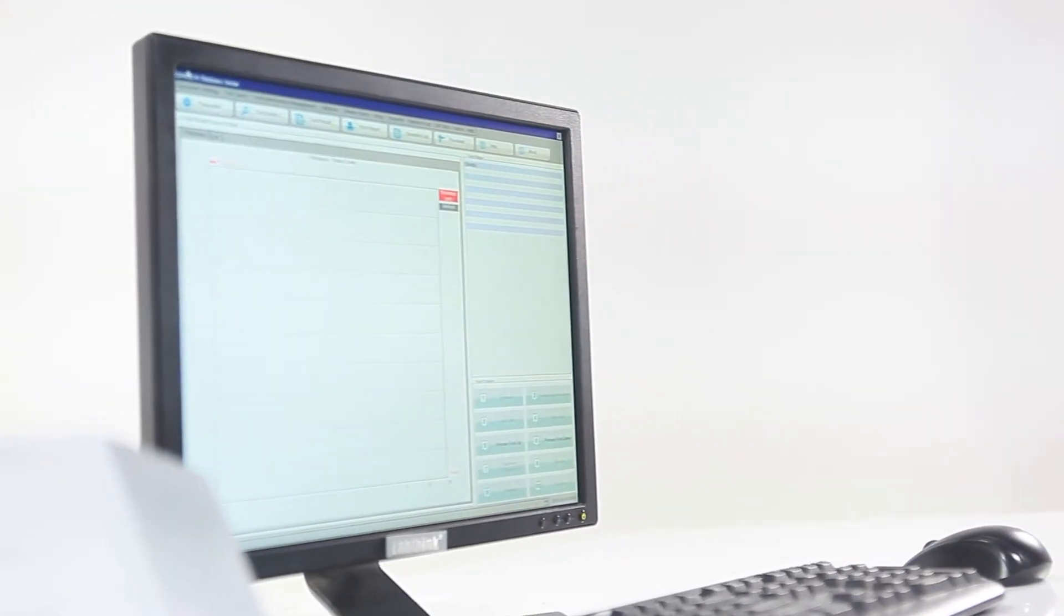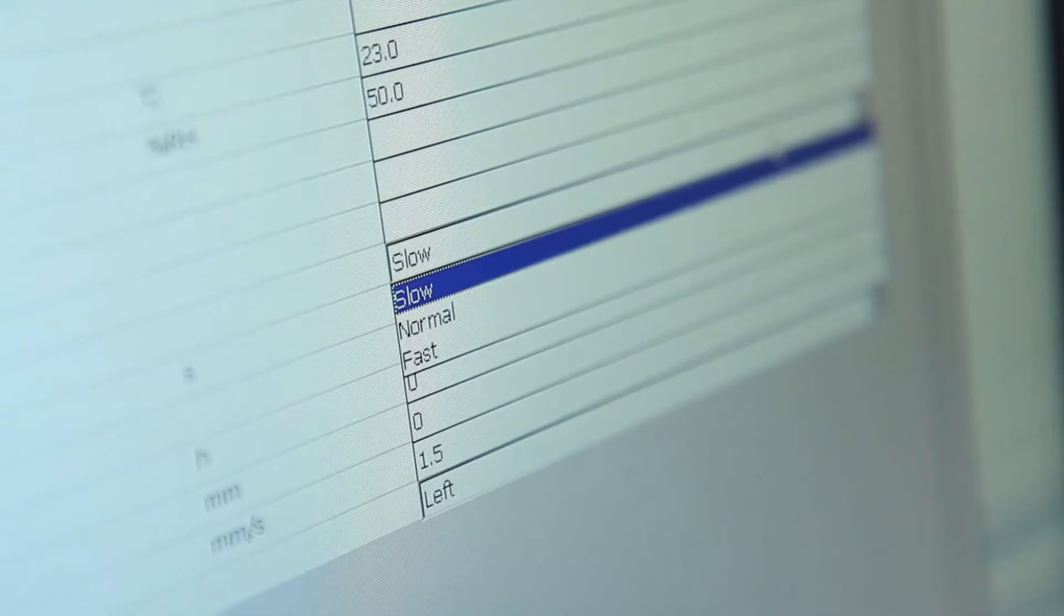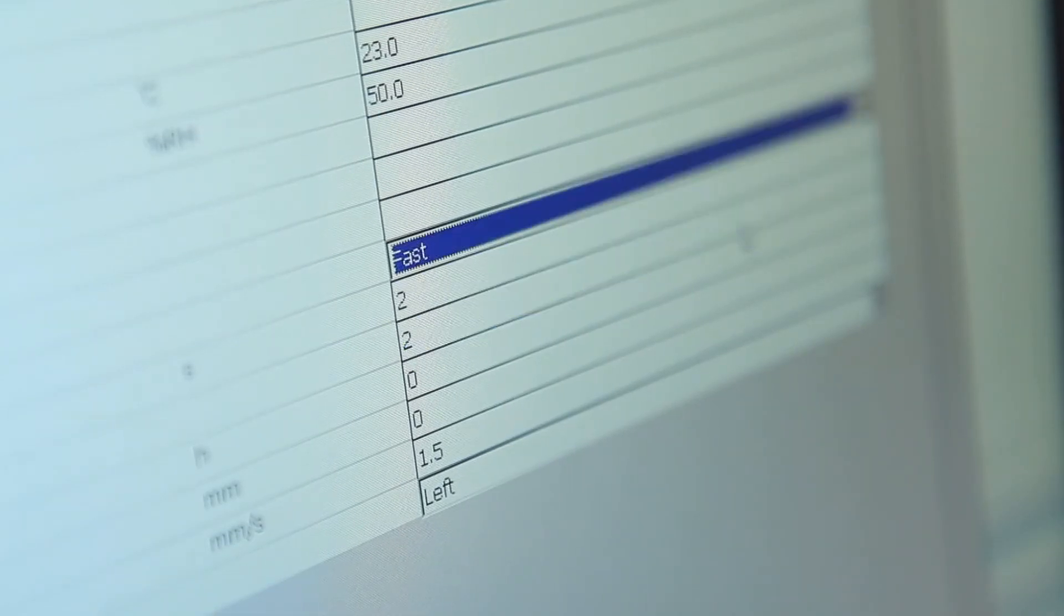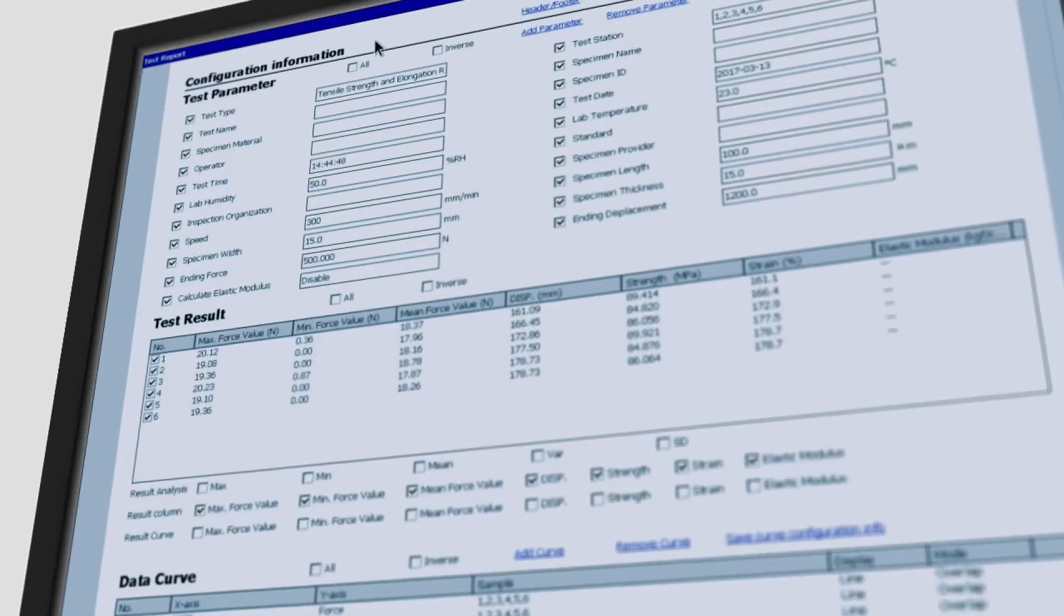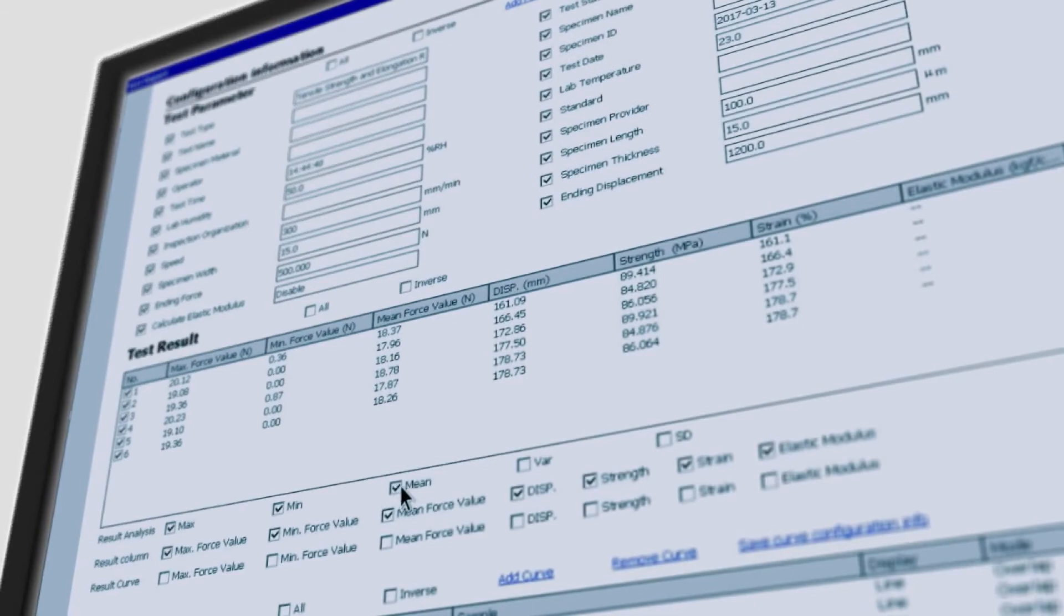C640 supports intelligent control and data processing functions which enables the user to save all test parameters in a file so that parameters can be applied directly for the same tests next time. Test results include maximum value, minimum value, average value, and standard deviation which can be used in historical data comparison.